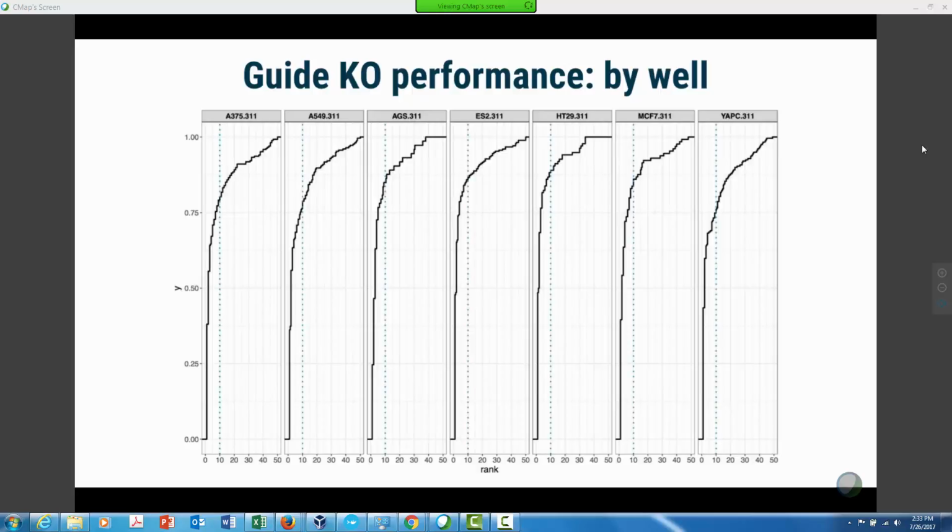Also, very important to note, all of these plots are only for our directly measured genes, so our landmarks. So it's a subset of the data. I just wanted to validate knockout performance in the things that we're directly measuring, and I'm also doing the majority of my preliminary analysis in that. And then once we have confidence in our directly measured data, I'll be expanding the analyses to the cohort overall. So yes, of our directly measured genes, about 70% of the guides seem to be working, which is great. We're pretty excited about it.